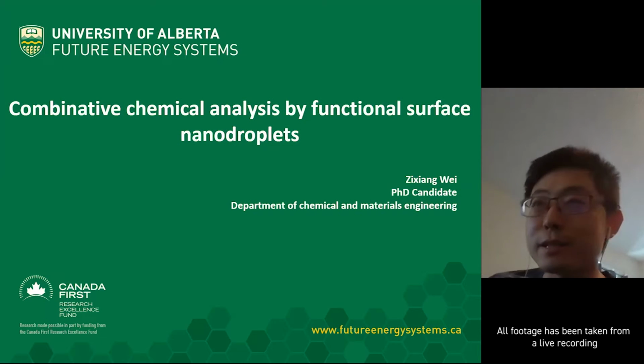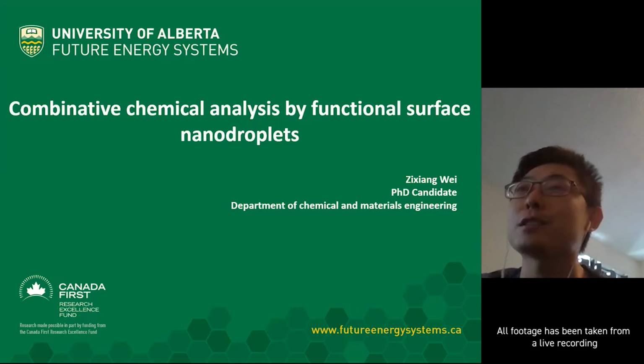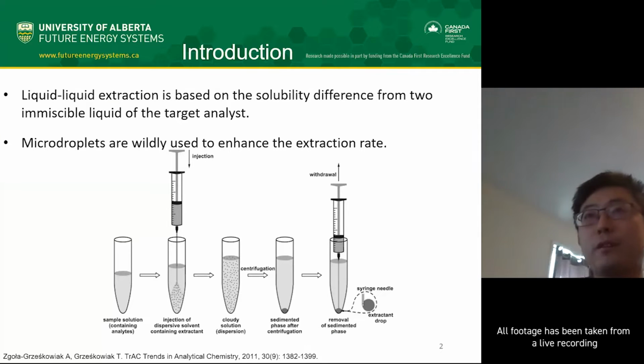Hello everyone. I'm glad to have this opportunity to share my work on combinative chemical analysis by functional surface nanodroplets. Here I would like to give a brief introduction to liquid-liquid extraction.